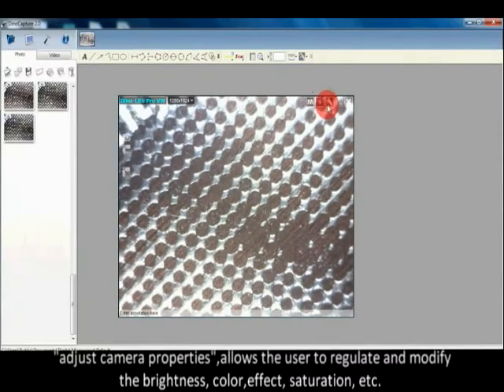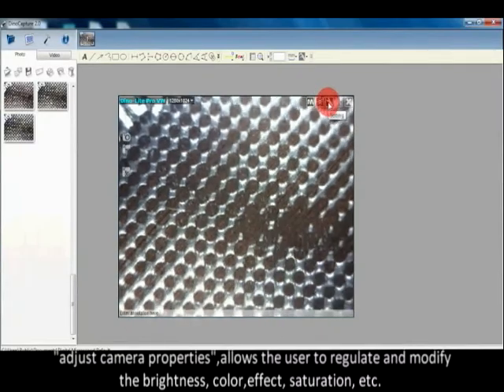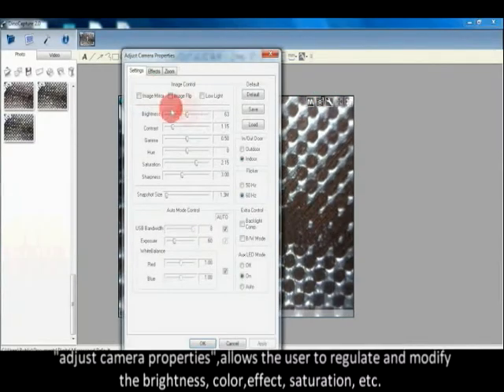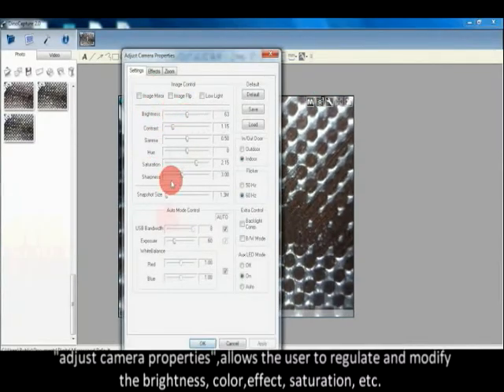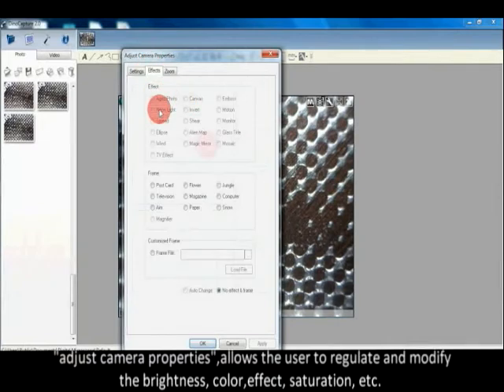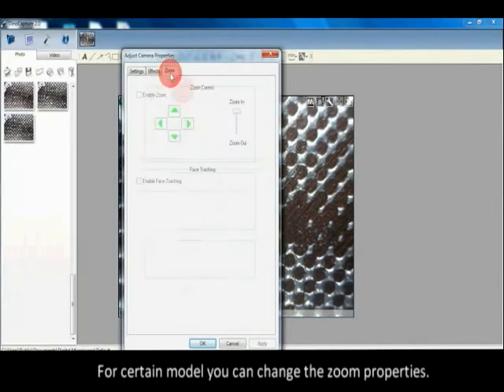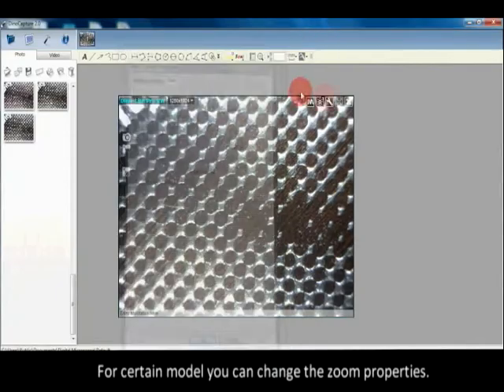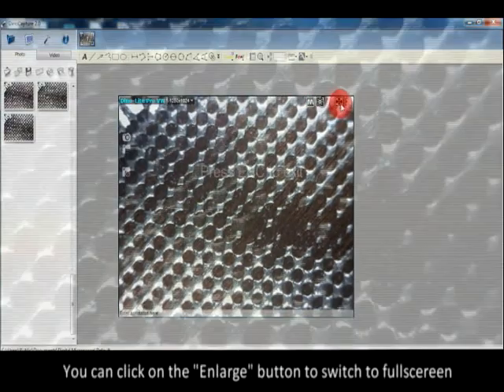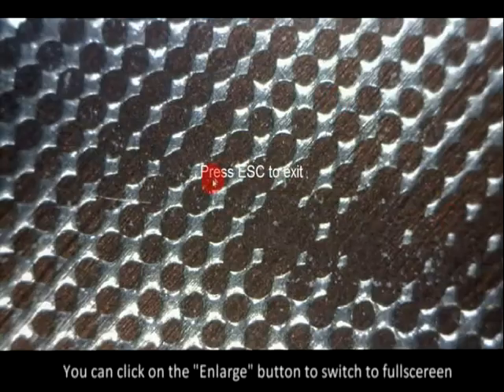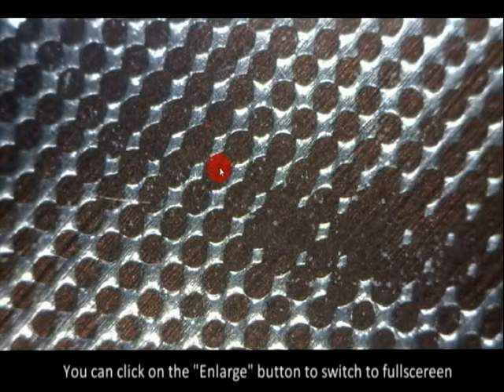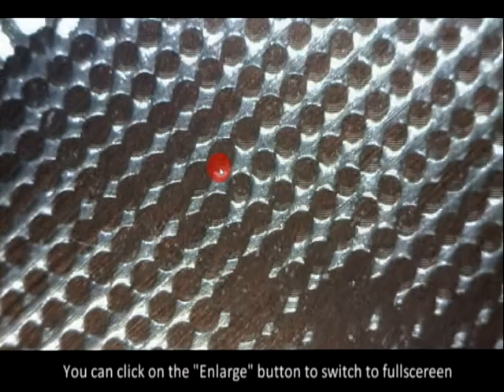Adjust camera properties allows the user to regulate and modify the brightness, color, effect, saturation, and other settings. For certain models you can change the zoom properties. You can click on the enlarge button to switch to full screen.